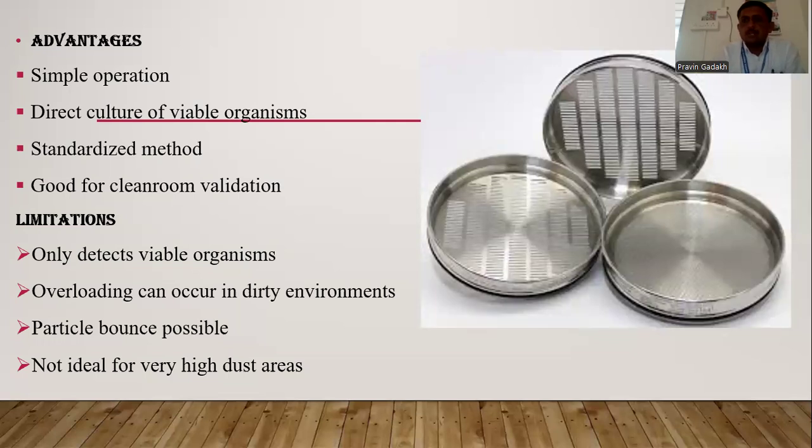Now we'll discuss the advantages of this sieve sampler technique. It is simple in operation. A direct viable count of microorganisms can be observed after 24-hour incubation. It is already a standardized method, and it is used for the validation of the cleanliness of a particular room. So no further glassware or equipment is needed, and we can observe the result after 24 hours for the cleanliness or validation of a particular room.